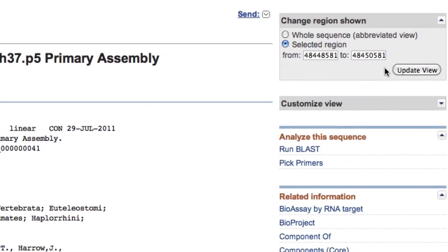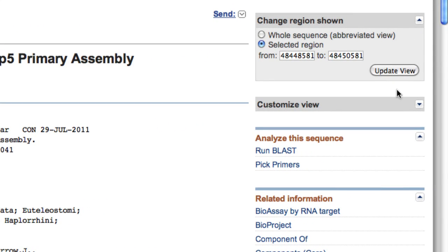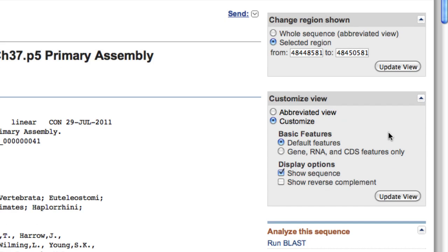The procedure for getting surrounding sequence is the same when your gene is on the minus strand, as long as the box is checked for Show Reverse Complement.